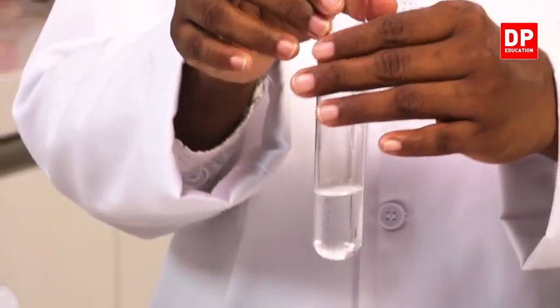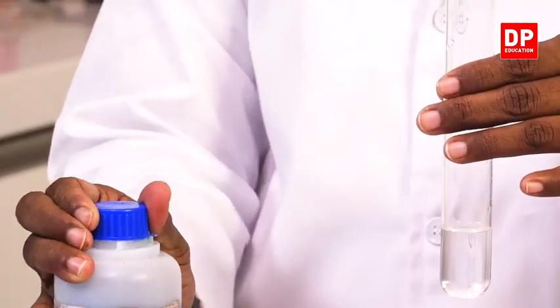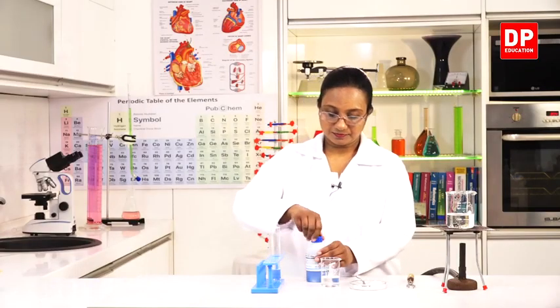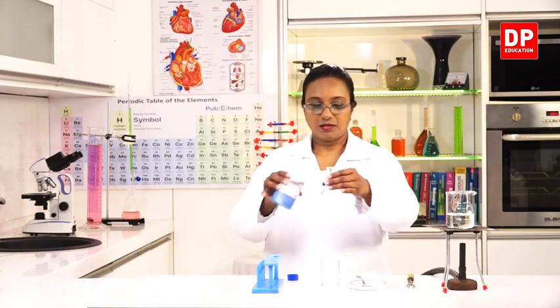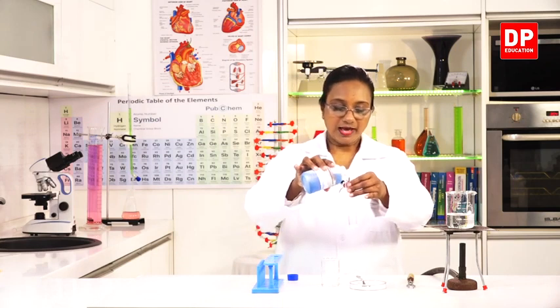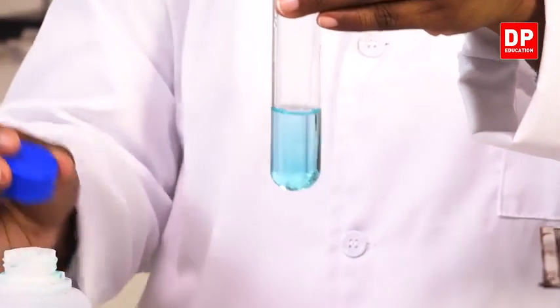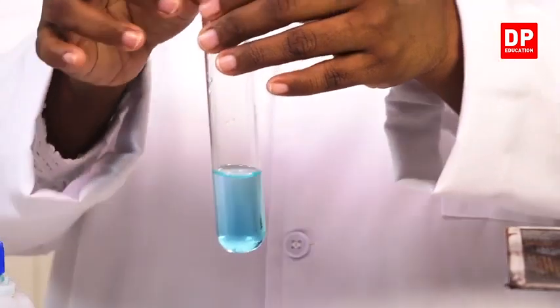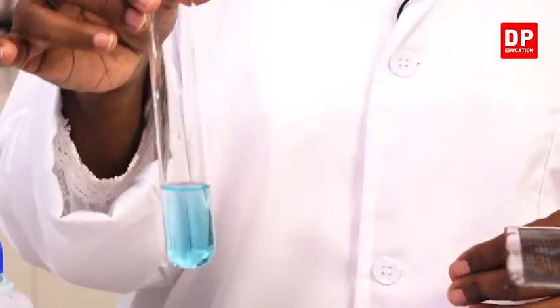Now that the glucose is dissolved and we have the glucose solution, to this I will add a little amount of Benedict solution. When we add a small amount of Benedict solution, you can see it has a nice blue color. But the observation of the activity will be after heating the solution.